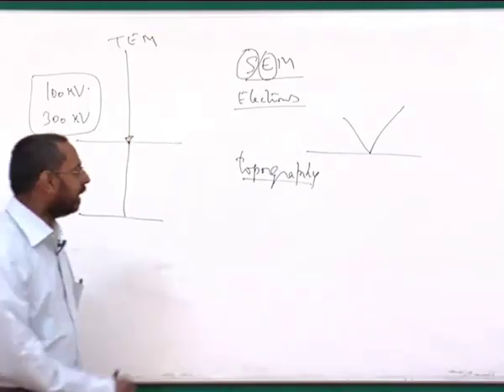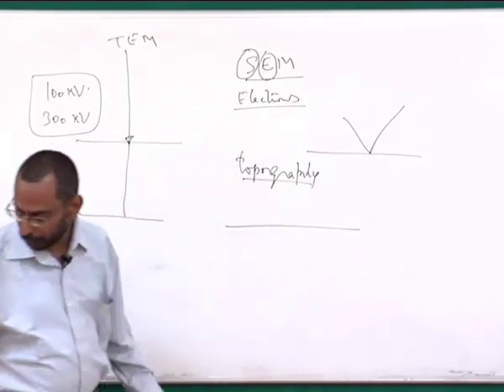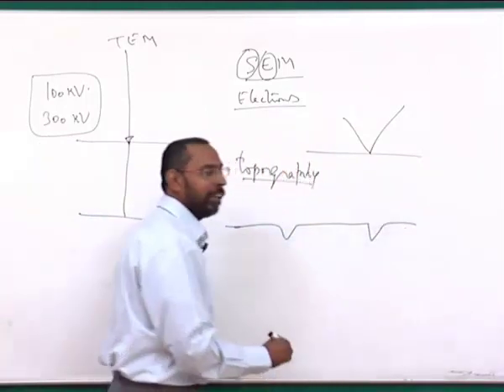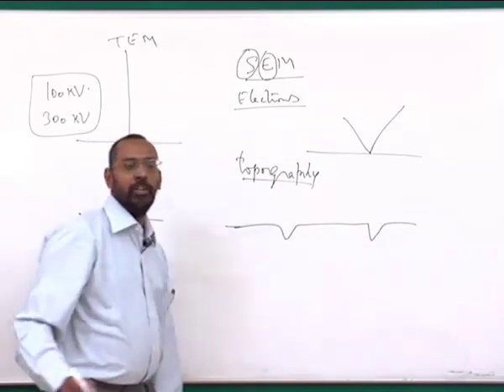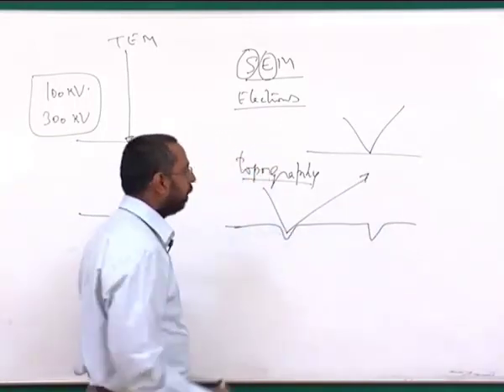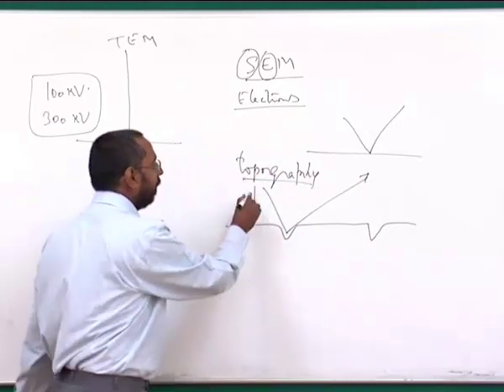The reason is, in optical microscopy, the image formation happens because of depth differences. For example, if you have a flat surface in which there are some grooves like this, formed by, let's say, a grain boundary, that groove is what you see as a black region, because the light that falls on it gets reflected out, but not into the objective. You are able to see this as a black region, whereas this region looks like a white region in an optical microscope.